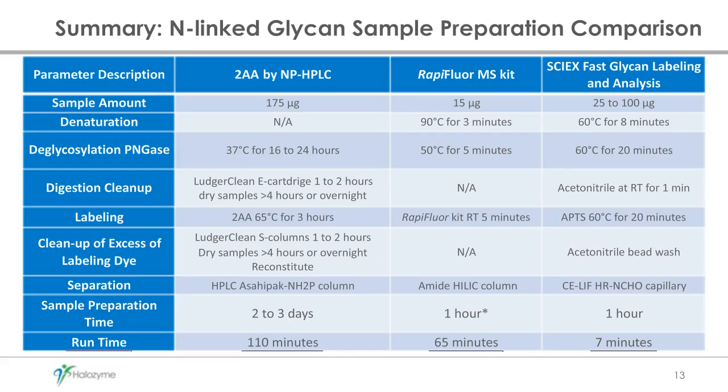For the RapidFluor, the sample preparation time is a little less than an hour, and for the SCIEX it is about an hour. The run time itself, 7 minutes, is actually pretty wonderful. And in addition, there's no column conditioning. We all know we have to recondition our capillary, but that happens very, very quickly, and it's even built in within the 7 minutes of your run. So it makes it very, very good.